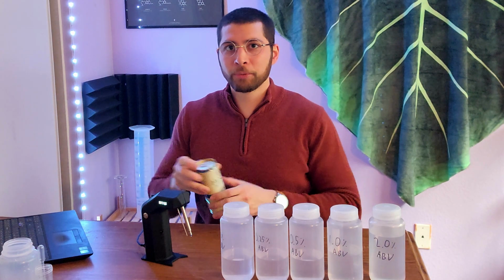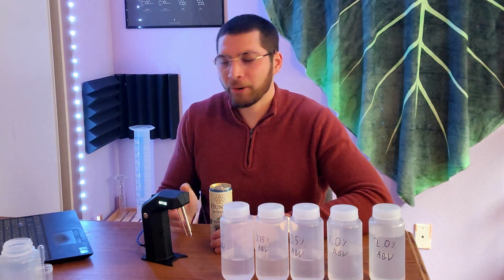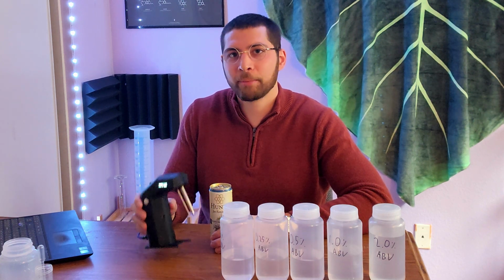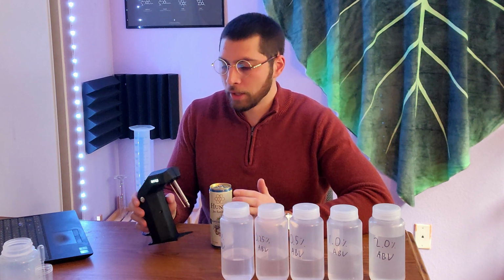So I was a kombucha brewer about 7 years ago now, and I ran into this issue of alcohol content in kombucha, and so I ended up inventing this machine that works like a breathalyzer for beverages.